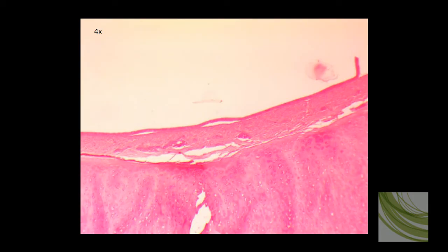Here is our first slide looking at this pseudostratified ciliated columnar epithelium using the 4X objective. Where do we want to find it? Well, we see a lot of different tissues on this slide, but the thing that we're looking for, the PCCE, is located in a strip on the edge. We don't see a lot of details. Underneath that, we can see some connective tissue, and this looks like some hyaline cartilage. We can see lacuna with little chondrocytes in them.